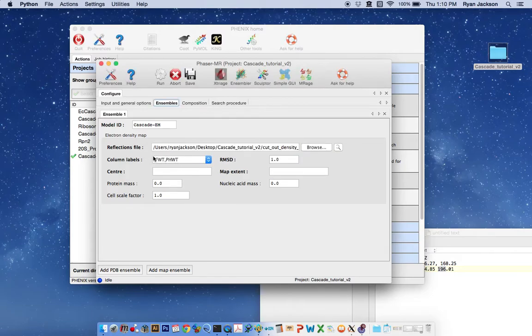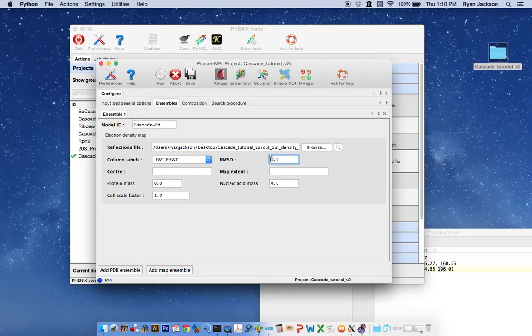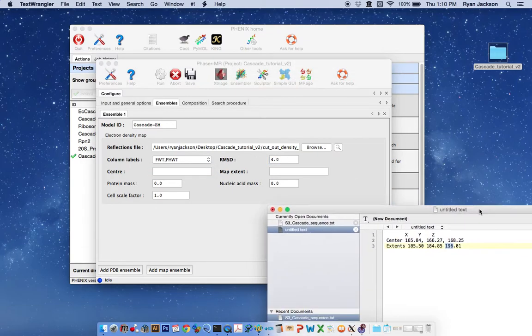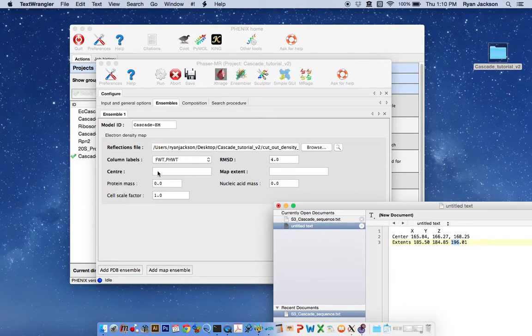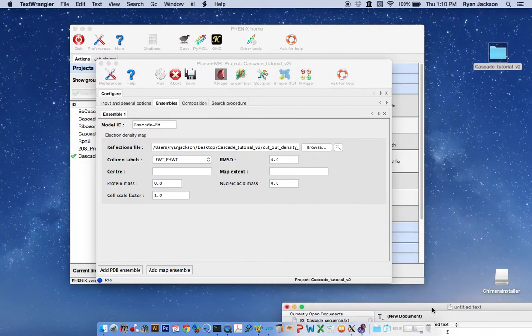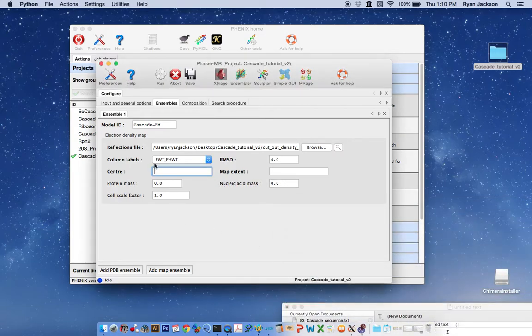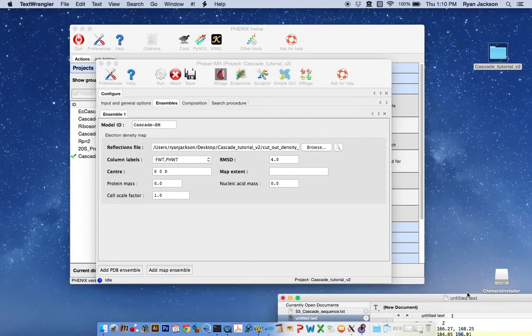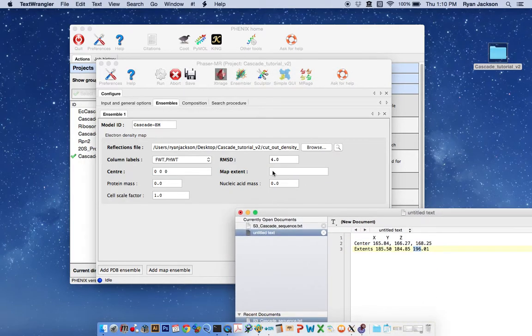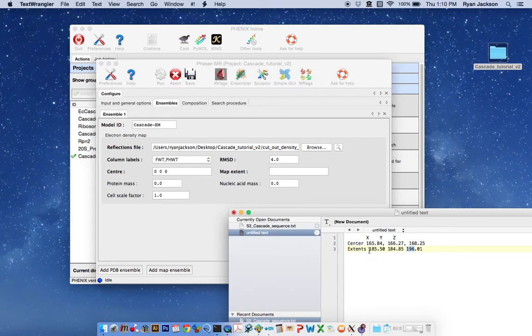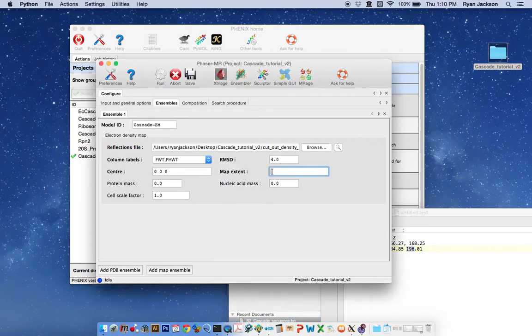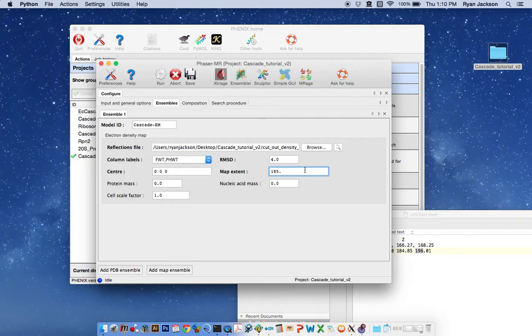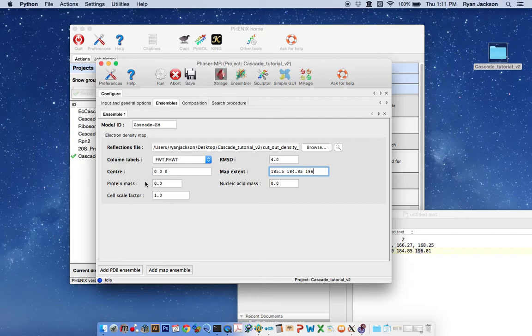The column labels here should populate. The RMSD is defined as basically a good rule of thumb is one half the resolution limit of the EM map. So in the case of Cascade it's 4 because we had an 8 angstrom EM map. Here are the center and extent values that we determined using coot in the previous tutorial. I've got those right here. The center, this is going to be the center of the cutout. And we looked at that and it's positioned at the origin, so it's 0, 0, 0, but the extents of the map will be the same as the preview of the original EM map. And so those are recorded here. The extents are 185.5, 184.85, 196.